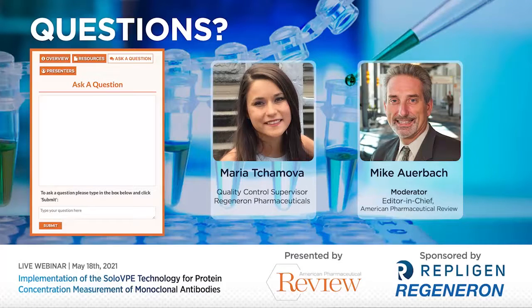Did you have to internally establish comparability between traditional UV-vis and SoloVPE before bringing this on for downstream applications in the QC space for release? Another great question. So we do not have to do this because we typically implement new technology for new products. That way we don't have to run comparability studies, but we do have a lot of data showing this just for our own interest and confidence in the method.